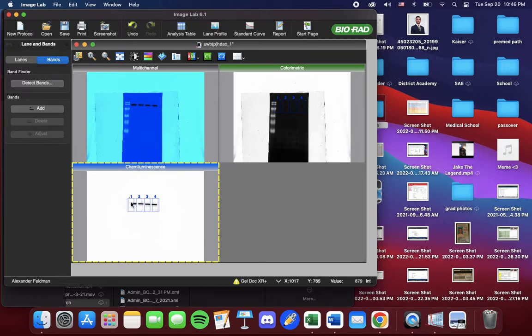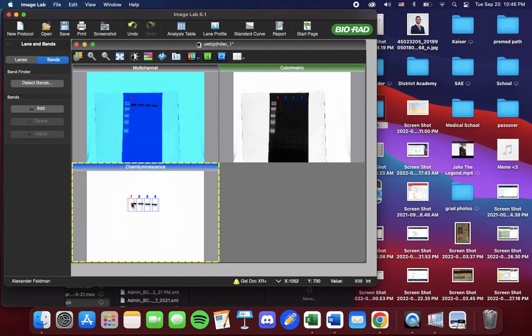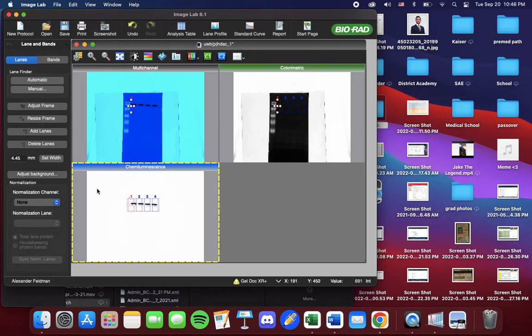We're going to select one of the lanes just by clicking on it, on the blot. Now I see it's selected. It's in red. I go back to Lanes and now we can manipulate it.